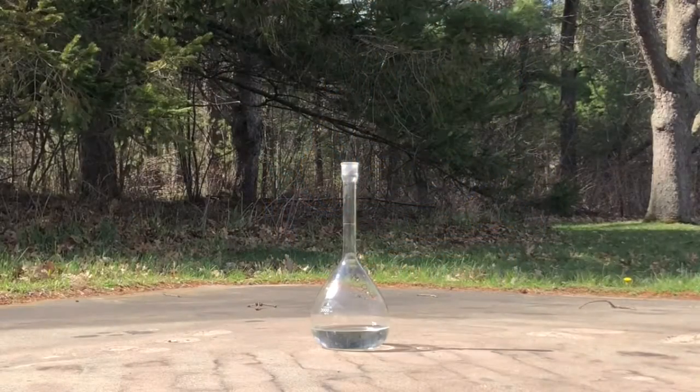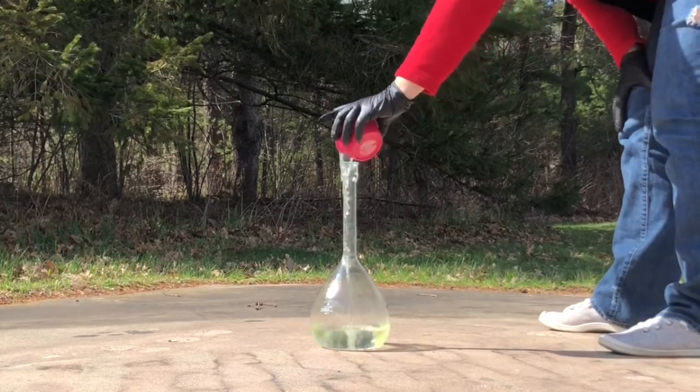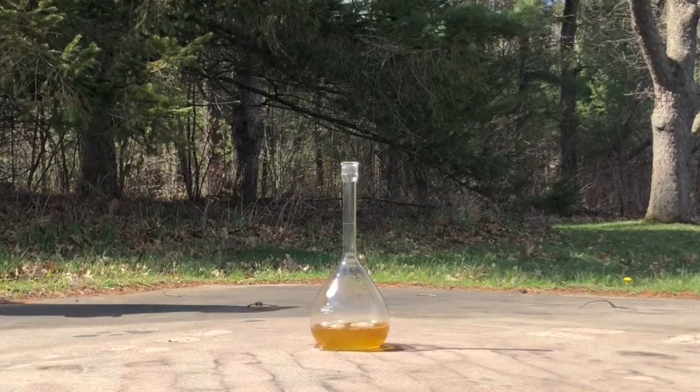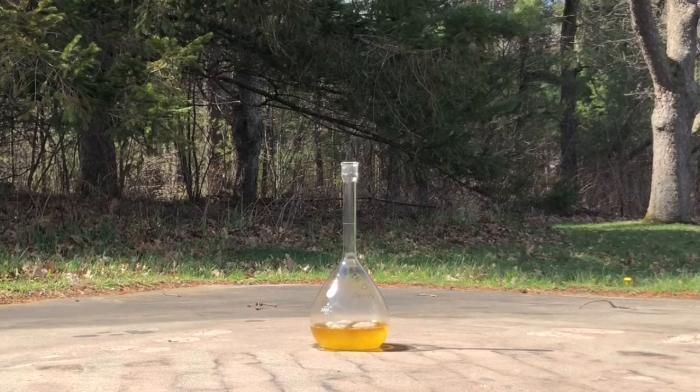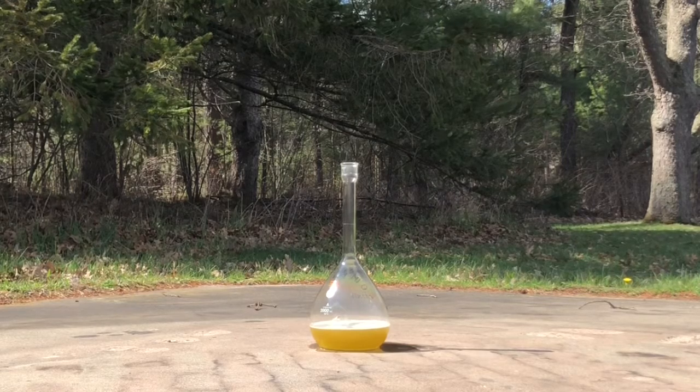Okay, the first one we're going to do is 3% hydrogen peroxide. This is the low concentration. We got a color change. We know a chemical reaction is occurring. We got bubbles. We'll give it a minute.